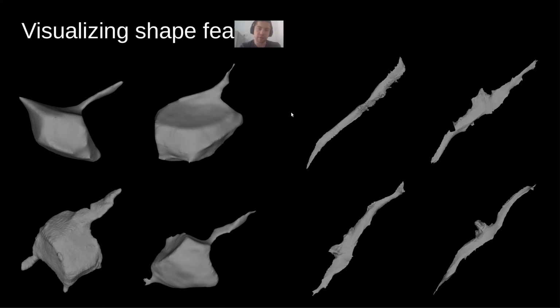These 4 cells on the left, which are neuron somata, correspond to the minimal value of this feature, which can be characterized as essentially these small, compact, roundish cells, and the maxima correspond to these long, flat muscle cells. So we clearly can also interpret some of the features that we actually learned.